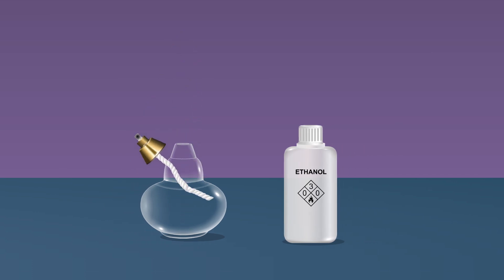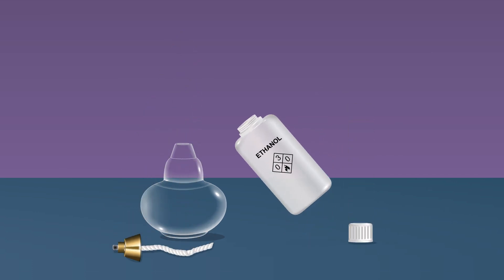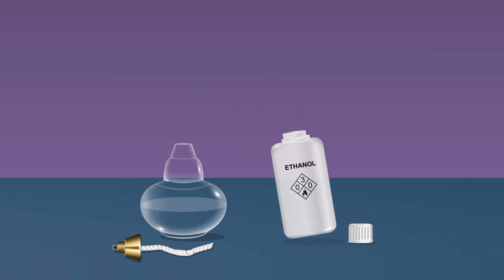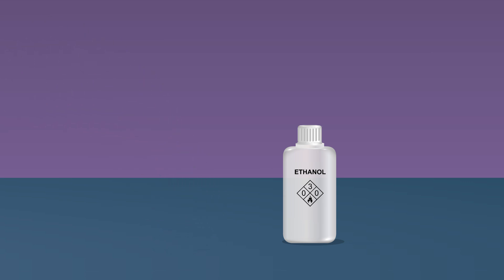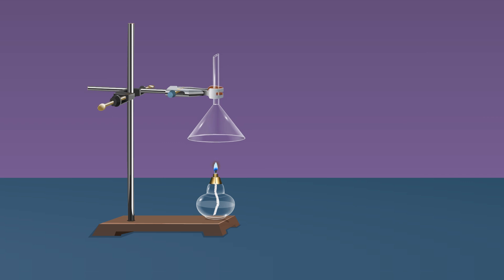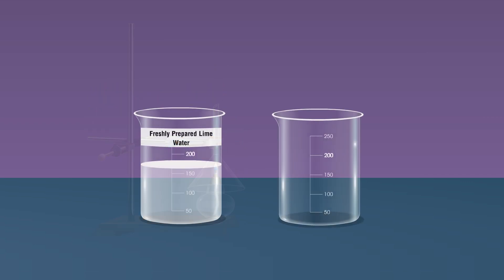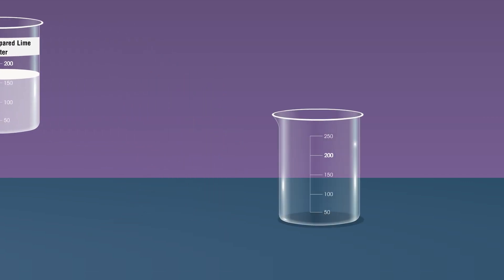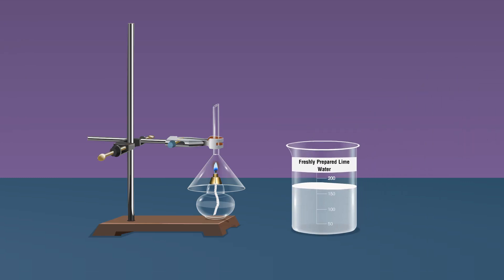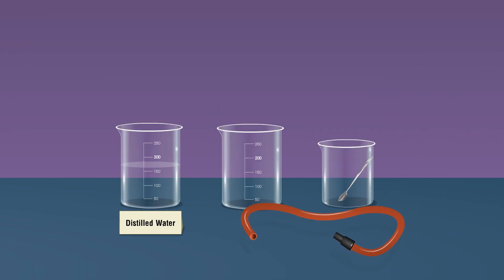Take ethanol as fuel in a spirit lamp, ignite it using a lighter, and cover the lamp with an inverted funnel using a clamp as shown. Take freshly prepared lime water which is kept in a beaker and take rubber tubing.